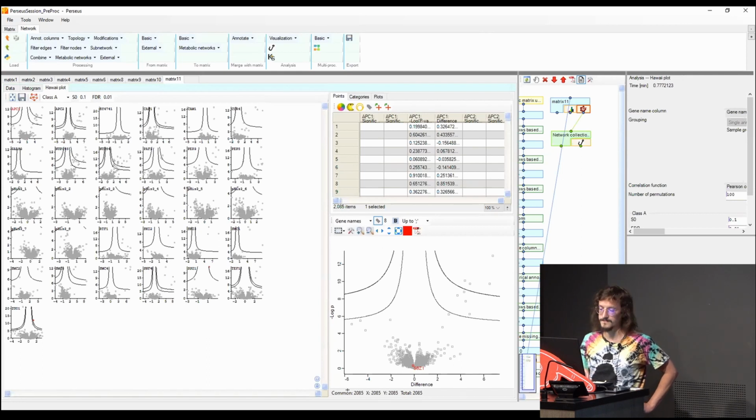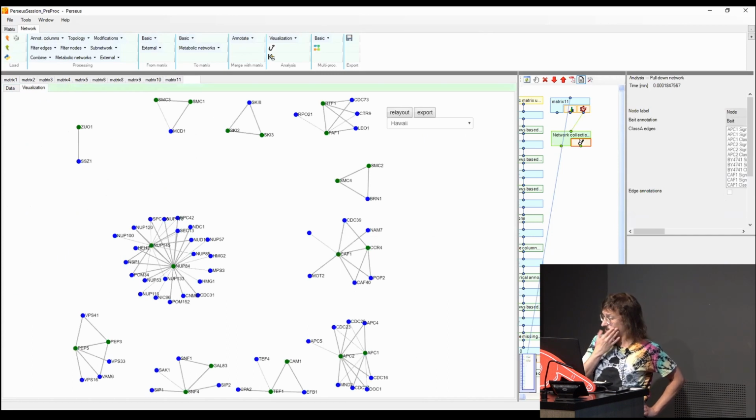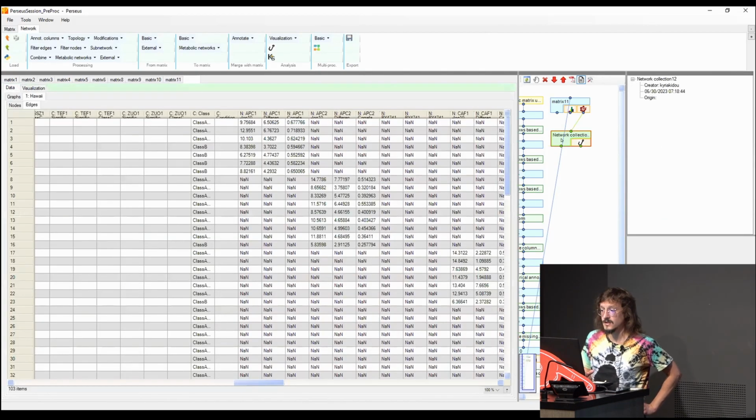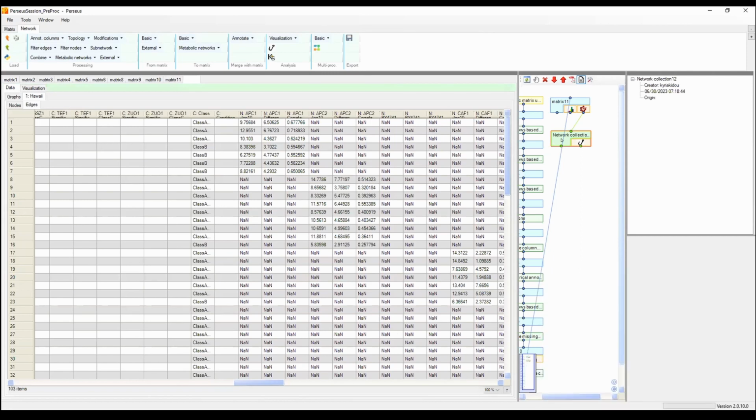And of course, I repeat again, everything that you see in this part of the graph is not considered and is removed, because that is an error. You don't expect to find anything there. So this is more or less what it is regarding the network. And of course, you can then also export the information. You can export this graph. You can export the network. When you export the network, remember that every time in Perseus, we export TSV files. So use the specific command in R or Python to import TSV.